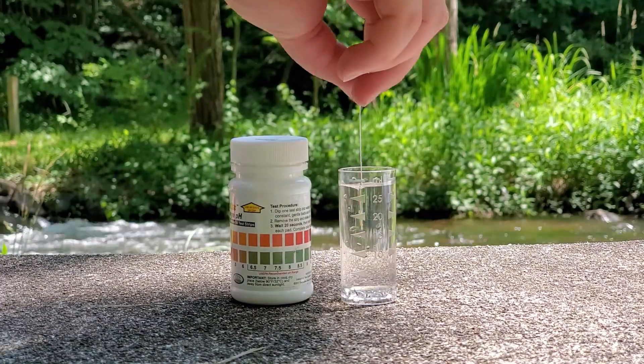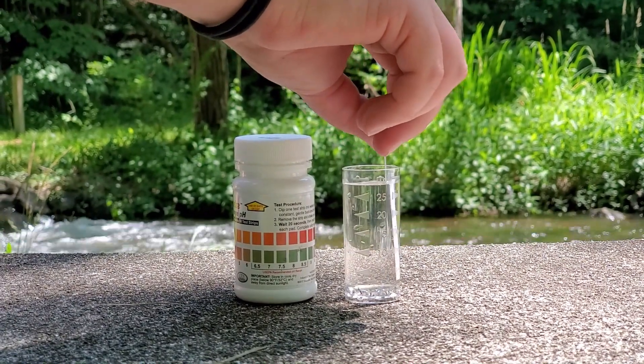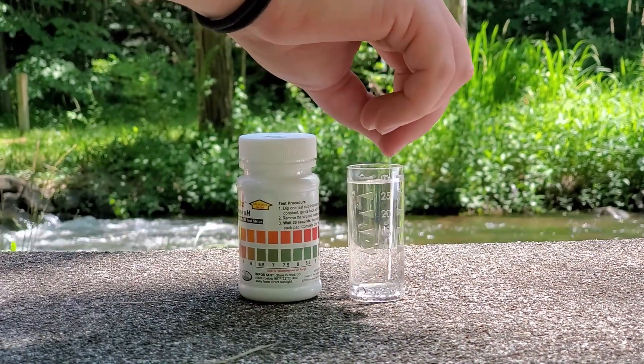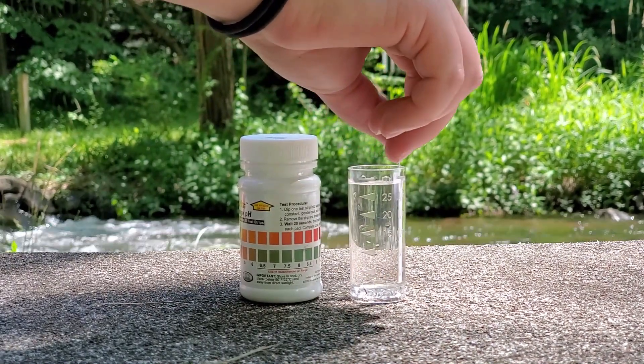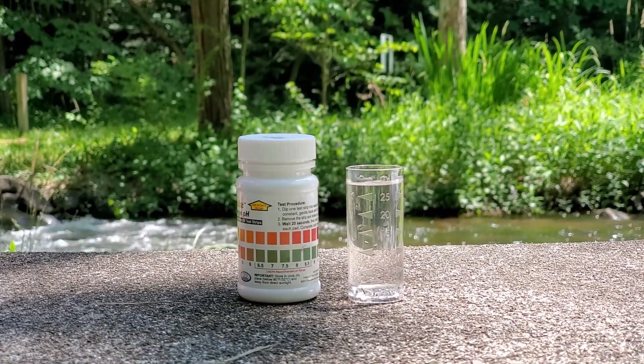Next, dip one test strip into the sample for 10 seconds with a constant, gentle back and forth motion like this. Then remove the strip, giving it one good shake to get rid of the excess water on the strip.